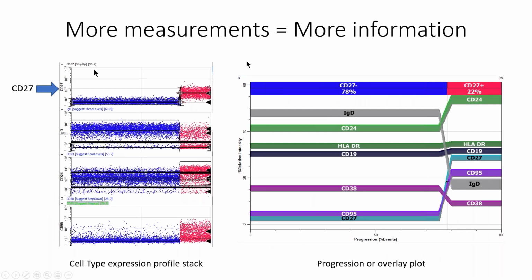If we look at this in an actual cell type, the common axis actually allows for scalability. In a cell type, the expression profiles are stacked, and each event will be evaluated and assigned a position. Every event in the sample file is accounted for.